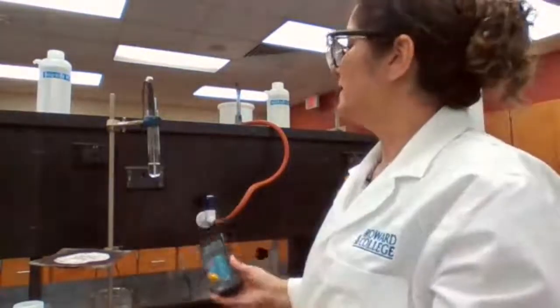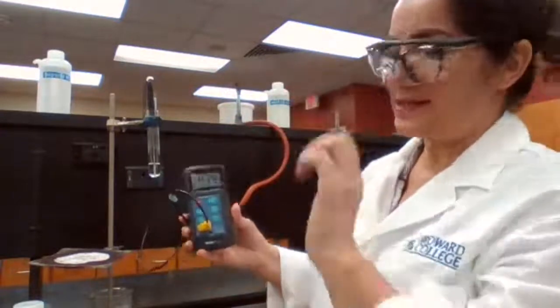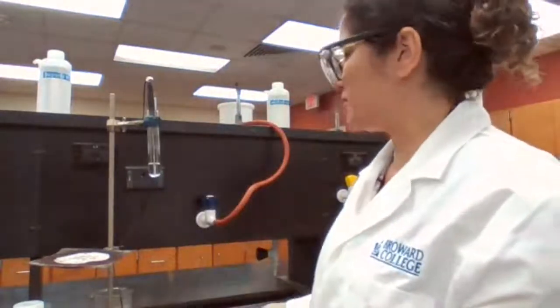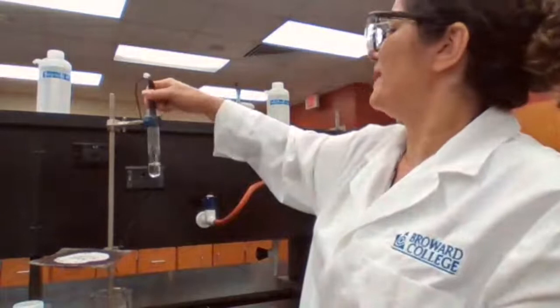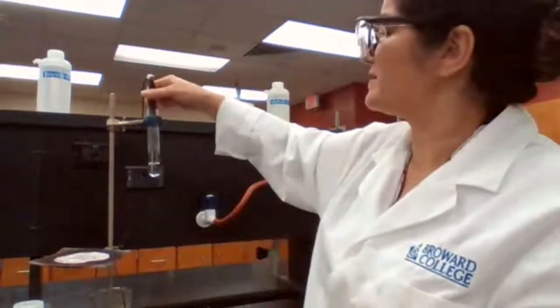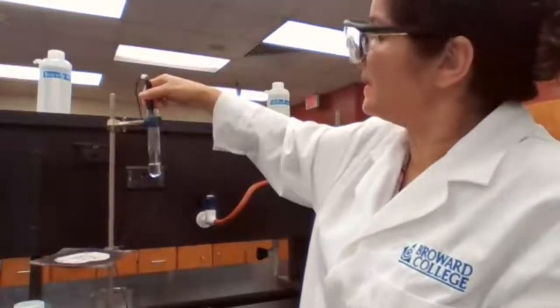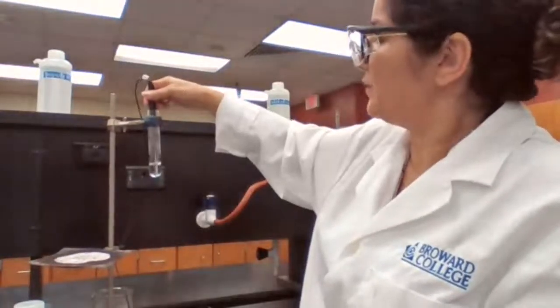We have to wait because, as I said, it could go low and then it goes back up. When it stays stable, we record the temperature. When it goes down and it goes back up, that means it went through the supercooling process. The temperature is lower than the freezing point, but the solution is still in liquid form.